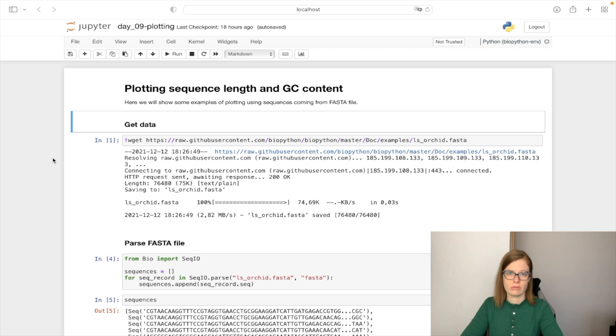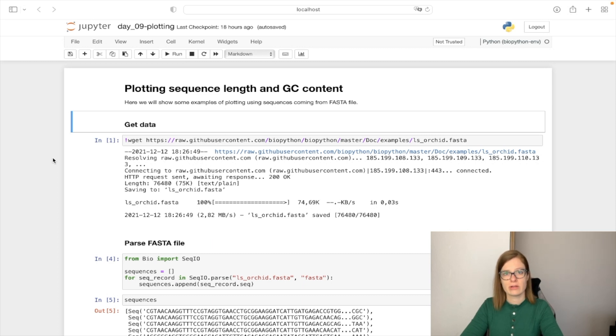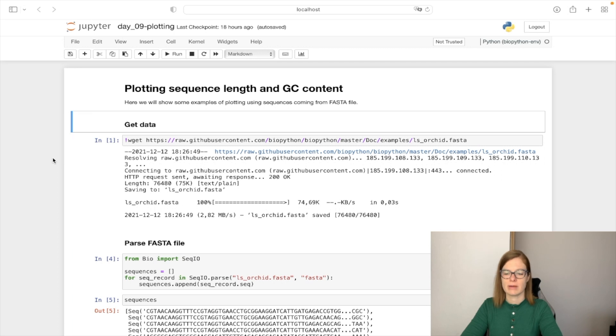First what we need to do is get the data. We are going to download the Orchid genome stored in FASTA file with wget command here.